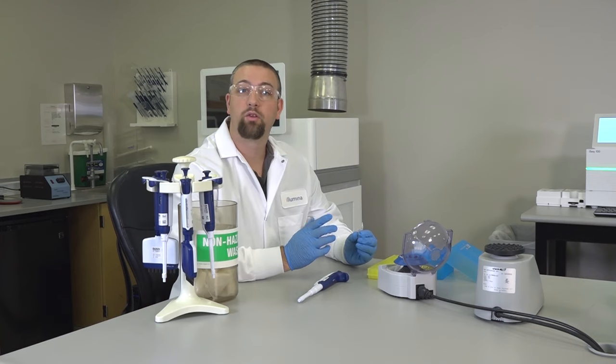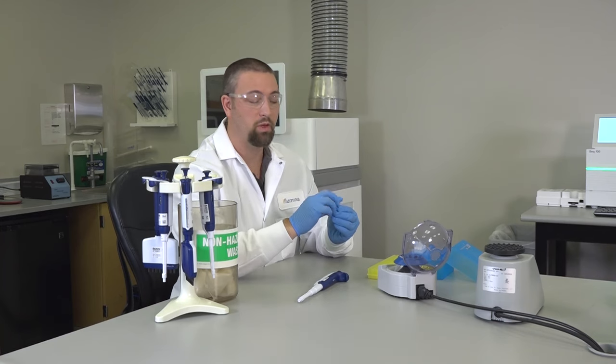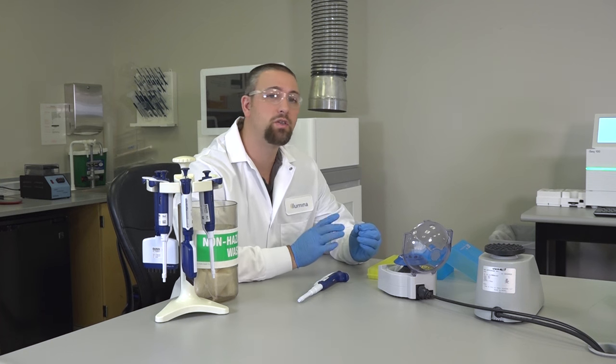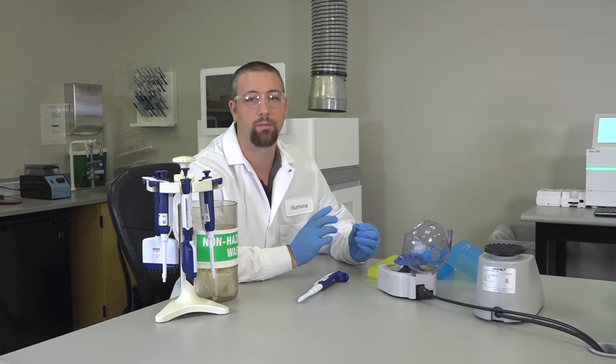Avoid spilling or splashing samples by carefully opening or closing tubes or plates. Spin down tubes or plates containing samples to make sure that all sample volumes are collected at the bottom of the well.